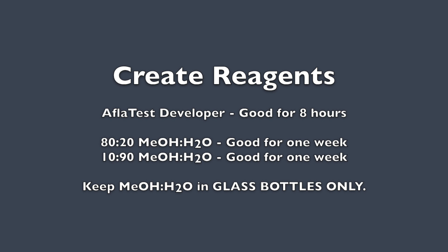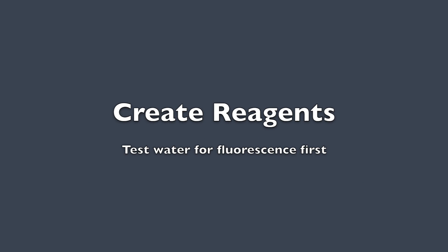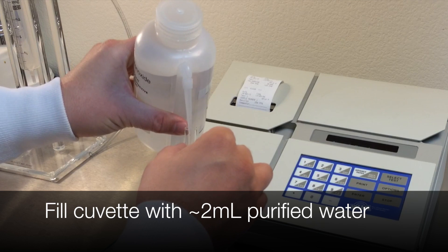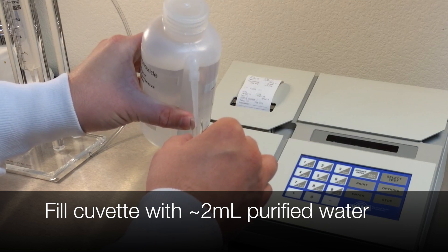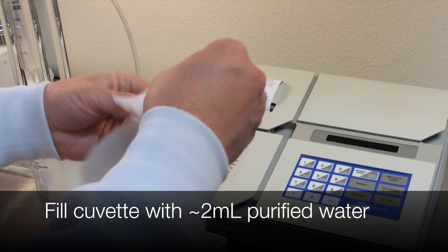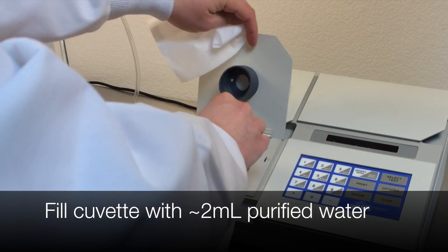To avoid unintended fluorescence, methanol and water mix should be kept only in glass bottles. All reagents depend on our water quality. We will test the water first for fluorescence. Fill a cuvette with 2 milliliters of water, wipe with a Kimwipe, and insert into the machine. We must have a zero result. If not, find a new source of purified water.